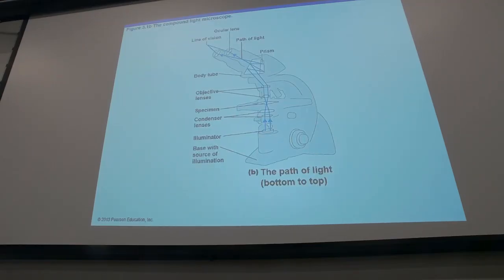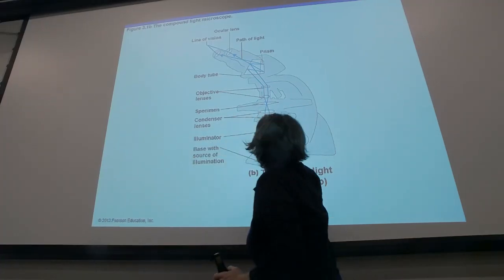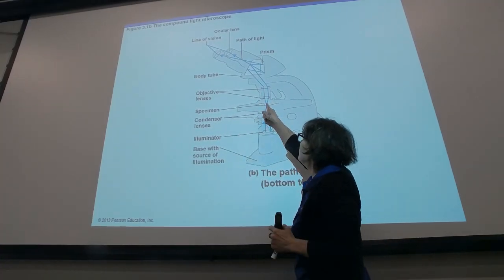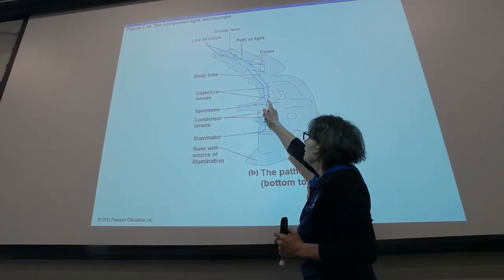And this is the pathway of light of the microscopes. So pretty much compound microscope, everything starts at the illuminator, passes to the diaphragm, the condenser lenses, and then into the specimen. So what the condenser lens do, because there are several rays of light, is basically focus it into a particular area in the specimen.